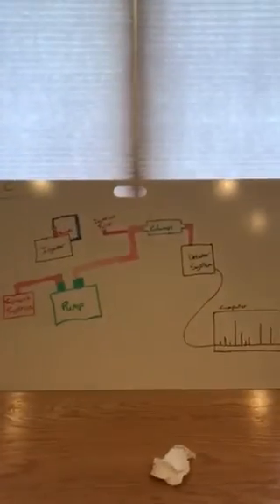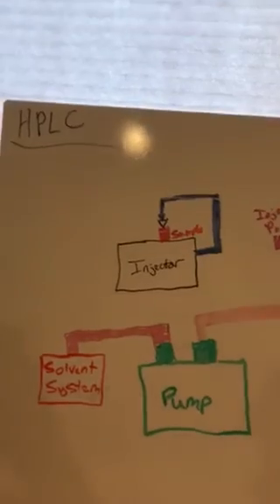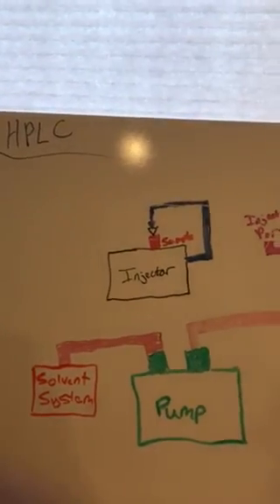Today we're going to be talking about my HPLC Analytical Lab project. To start off, we're going to be talking about our sample. In this case, our sample is a liquid sample, hence the name HPLC.